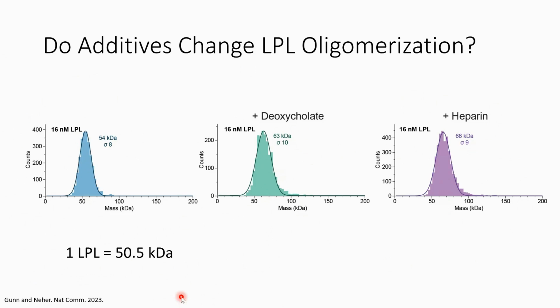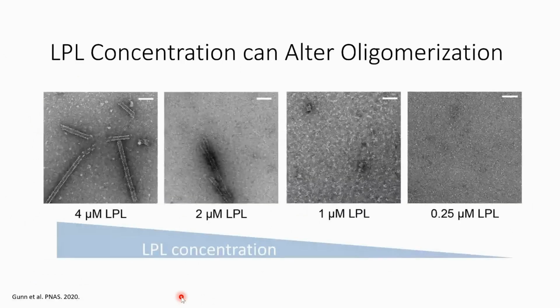So at that point, I obviously needed to go back to the drawing board about what causes the dimerization. It wasn't actually the deoxycholate like I had thought it could be.